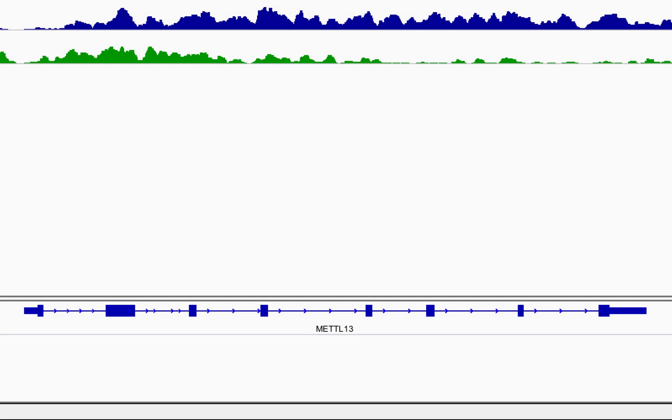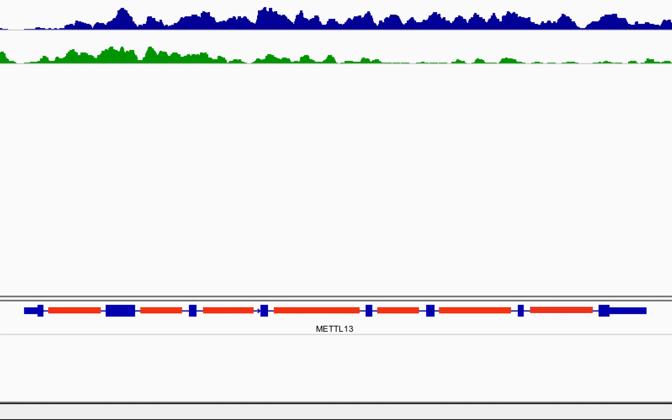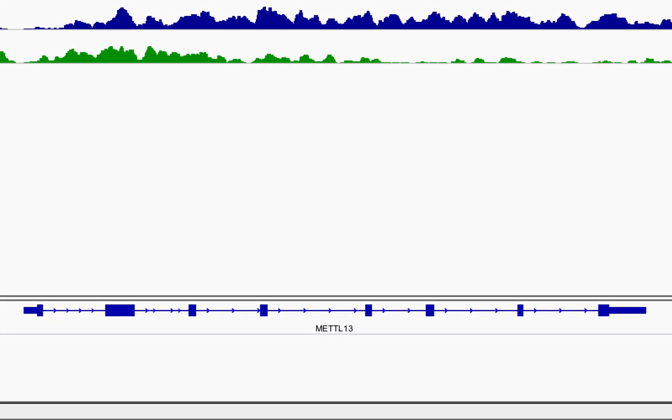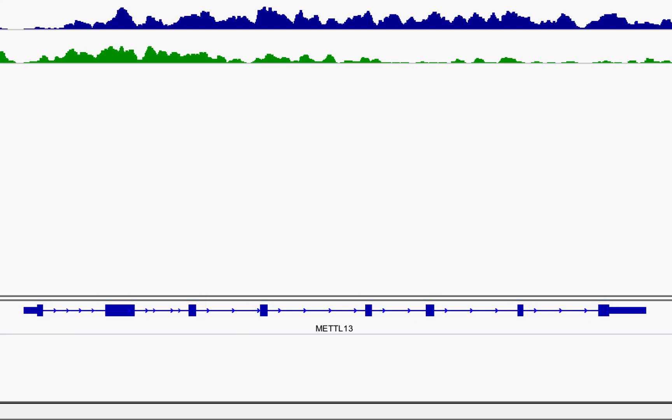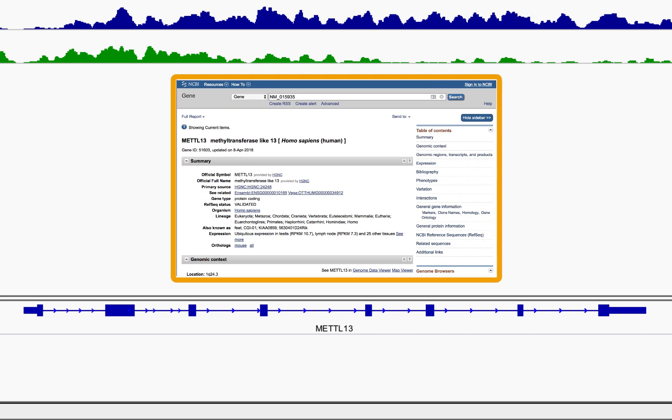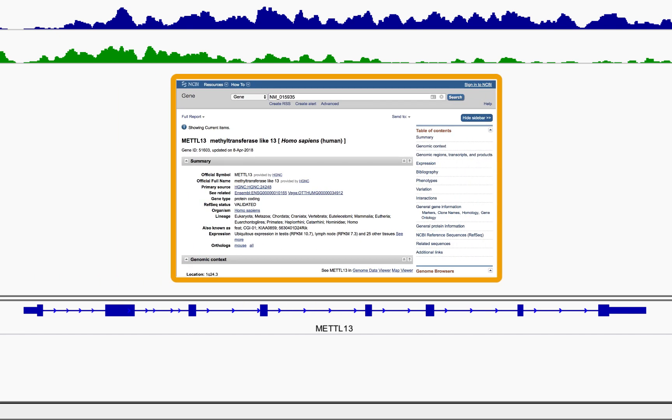Here we can see that MET-L13 has a 5' UTR, a 3' UTR, 7 introns, and 8 exons. Clicking on a gene in the sequence track will open the NCBI page for that gene in your browser.